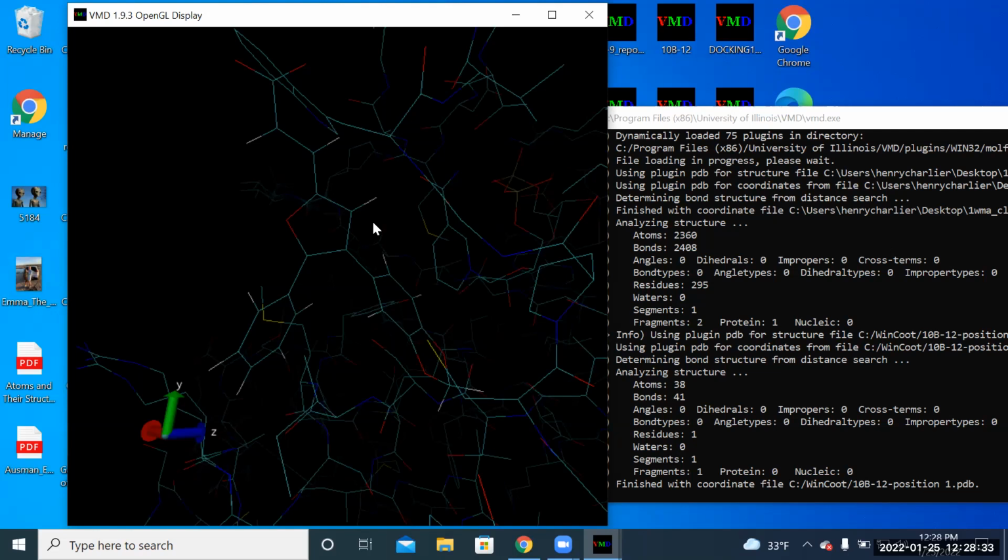That range is reserved pretty much for hydrogen bonds, I would say. And if you had a salt bridge, an ionic negative charge, positive charge interaction, you might be able to get that close. Outside of that, everything else should be beyond 3 angstroms.